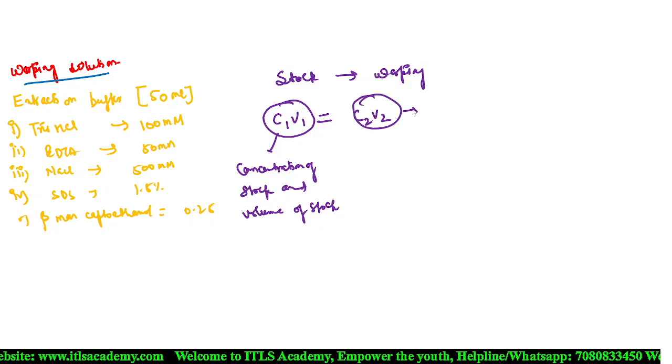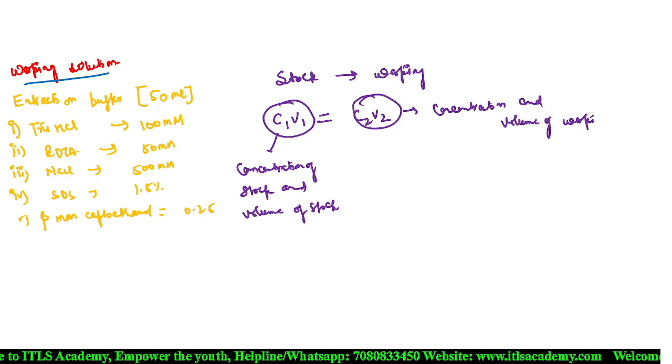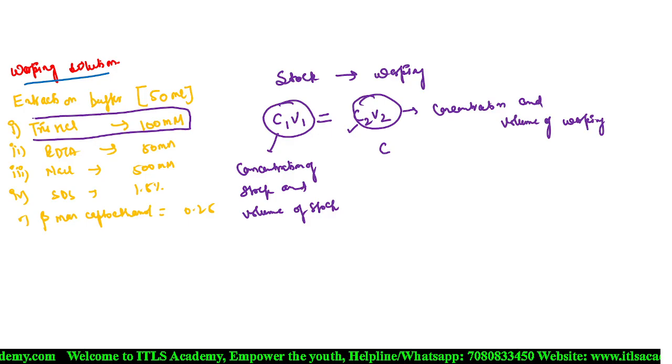And C2V2 is the concentration and volume of the working solution. We have C2V2.